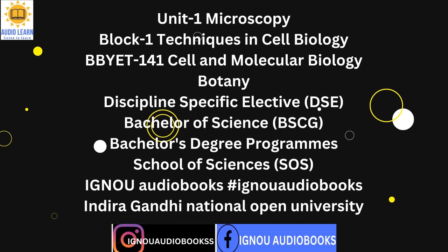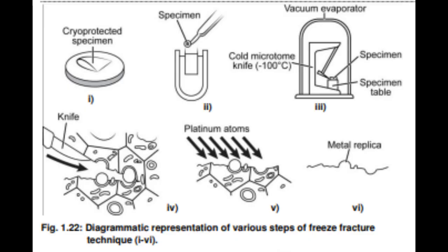General outline of technique. 1. Cells are frozen in liquid freon, minus 130 degrees C. This results in instant immobilization of cell components. 2. The block of frozen cells is fractured in an evacuated chamber. The fracture is irregular and occurs along lines of weakness like the plasma membrane or surfaces of organelles. 3. A replica of the fractured specimen is made by shadowing with platinum.